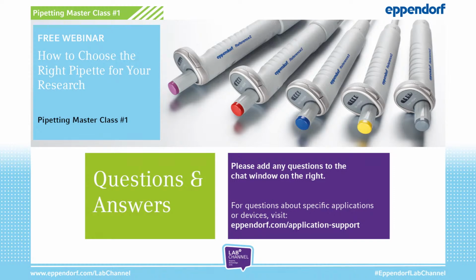All right. As far as I can see, we have another question. Basically, there is a question regarding accuracy checks between calibrations. Do we have any recommendations on whether accuracy checks between calibrations should be performed, and how to do it?